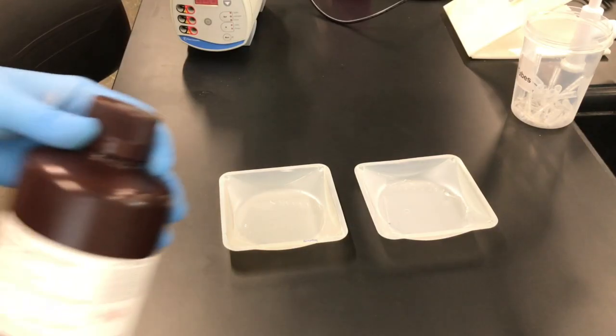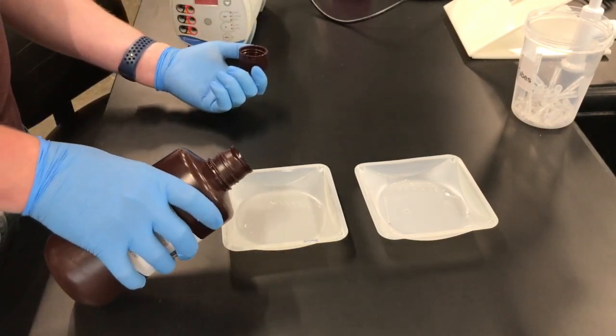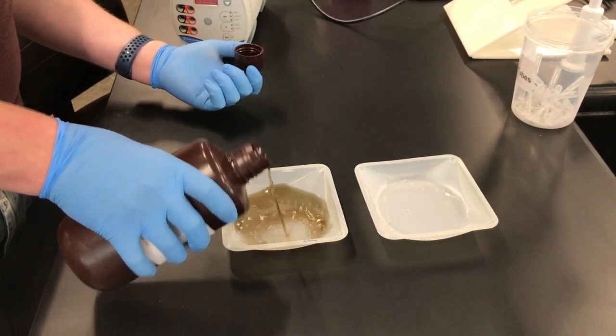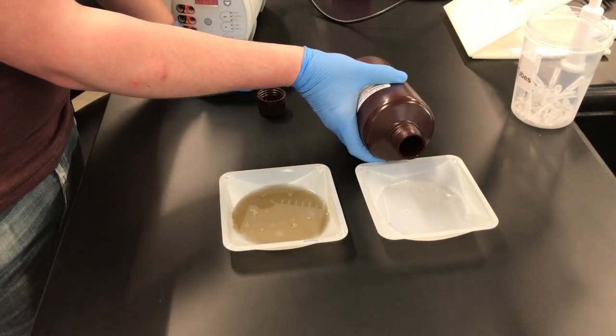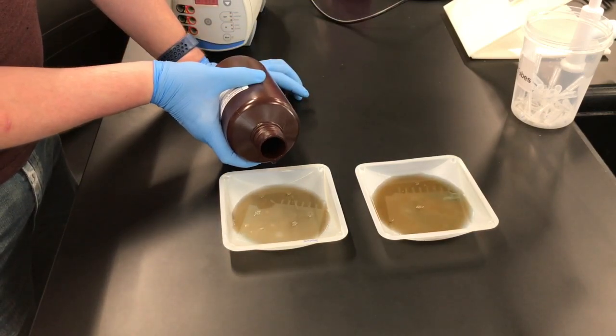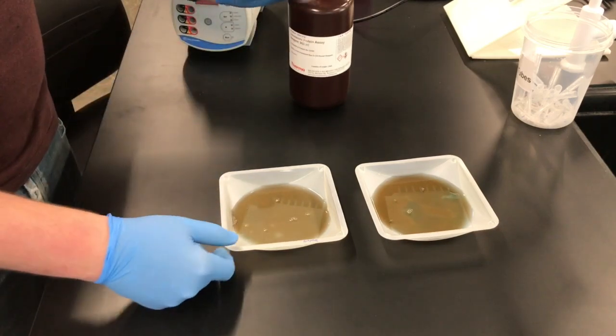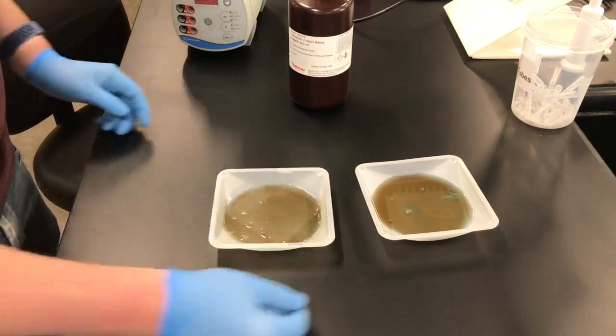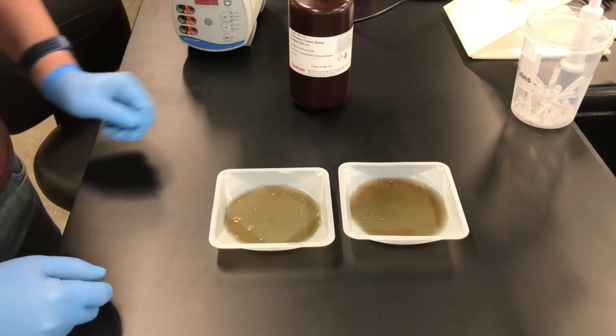For the Coomassie staining of gels, we're actually going to be using the same reagent that we used in last week's lab for the protein quantification Bradford assay. We're going to pour it onto the gels and then set these in a shaker incubator at 37 degrees for about one hour, rotating at about 60 revolutions per minute.